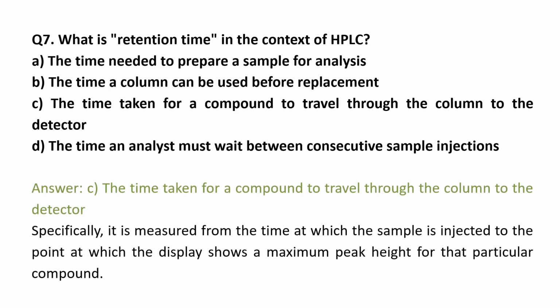So the answer is time taken for a compound to travel through the column to the detector. Specifically, it is measured from the time at which the sample is injected to the point at which the display shows a maximum peak height for that particular compound.